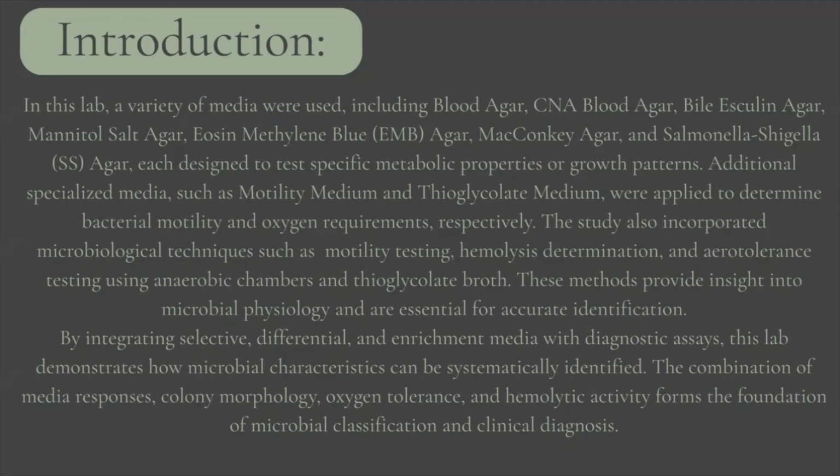and oxygen requirements, respectively. The study also incorporated microbiological techniques such as motility testing, hemolysis determination, and aerotolerance testing using anaerobic chambers and thioglycolate broth. These methods provide insight into microbial physiology and are essential for accurate identification. By integrating selective, differential, and enrichment media with diagnostic assays, this lab demonstrates how microbial characteristics can be systematically identified. The combination of media responses, colony morphology, oxygen tolerance, and hemolytic activity forms the foundation of microbial classification and clinical diagnosis.